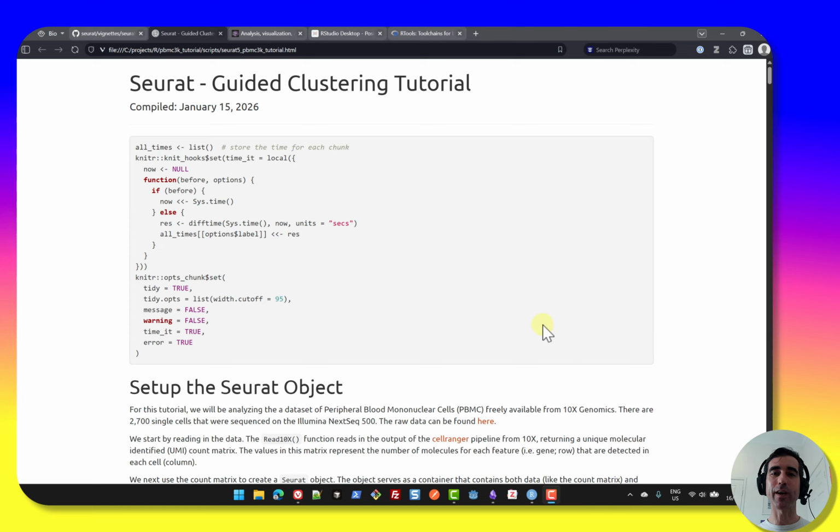Now, full disclosure, I have been building software most of my life. I build web applications, games, AI agents, lots of cool stuff, but I've only started learning biology in the last couple of years. It's become an obsession of mine. And it's only been recently that I started bridging the world of biology with software by teaching myself bioinformatics. So please let me know in the comments if I make any mistakes, if you have any feedback or suggestions. So with that said, let's get started.